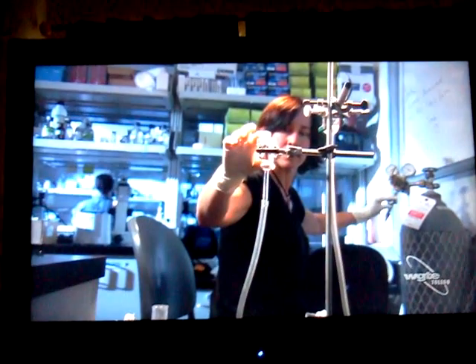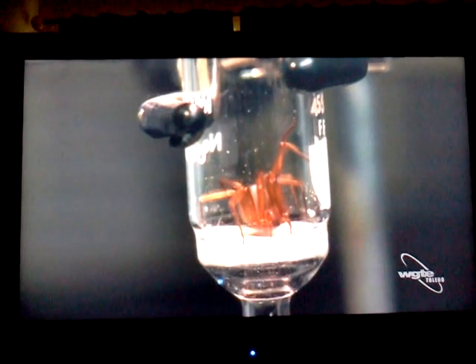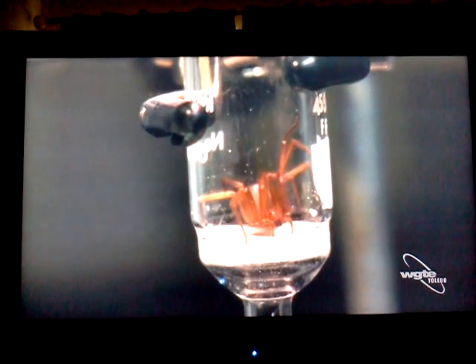There's a flow of CO2 coming through, and she runs out of oxygen.